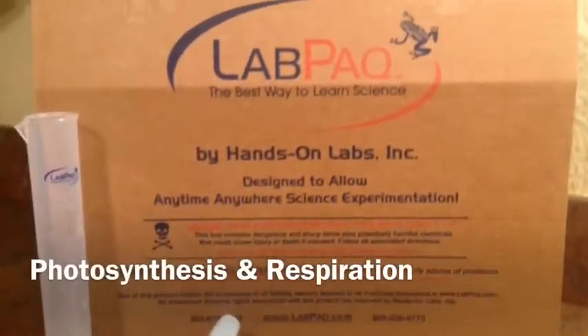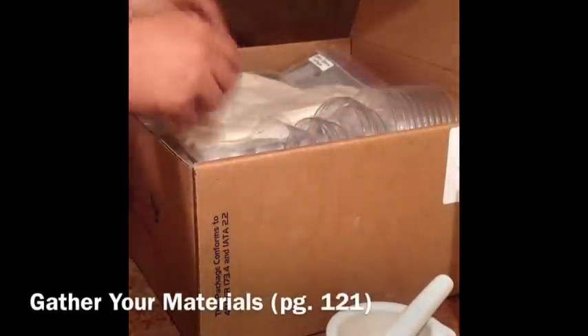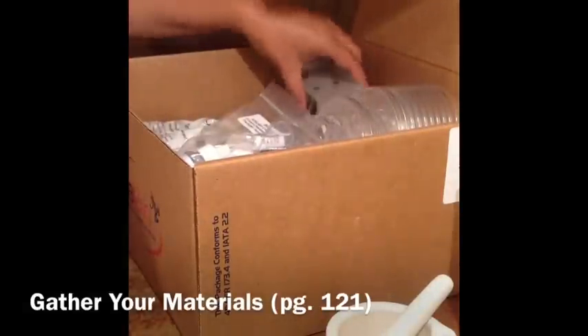Here's a brief overview of how to set up your photosynthesis and respiration lab. See page 121 of your lab manual for a list of materials that you'll need to provide and those from your lab pack.